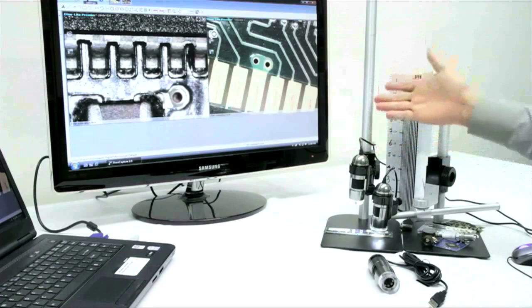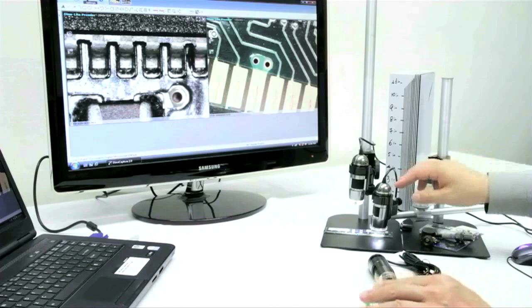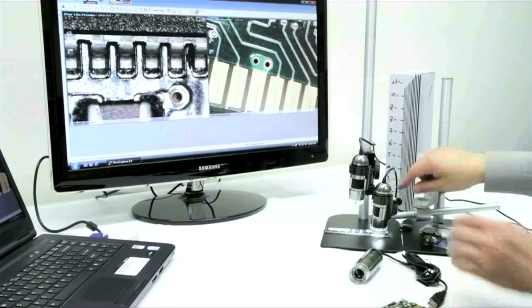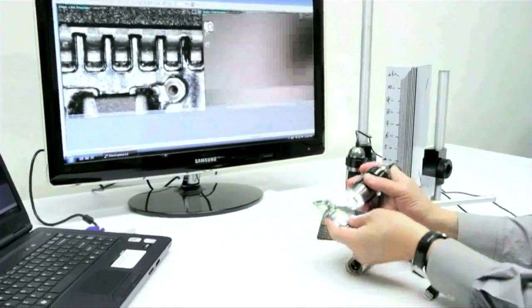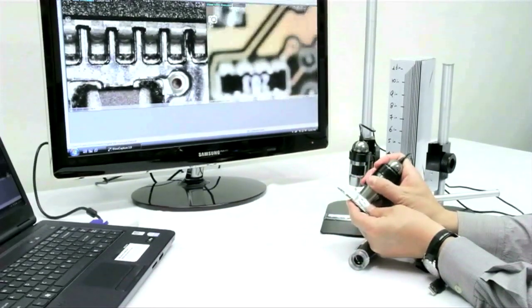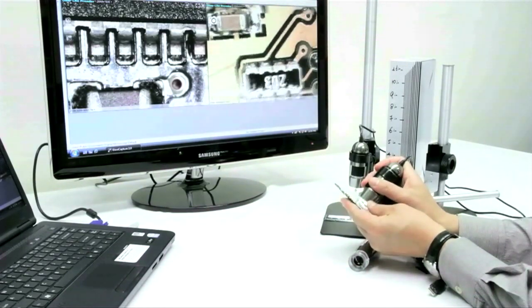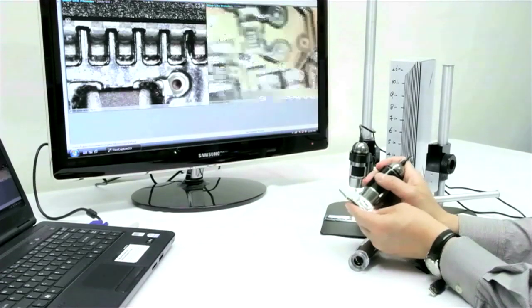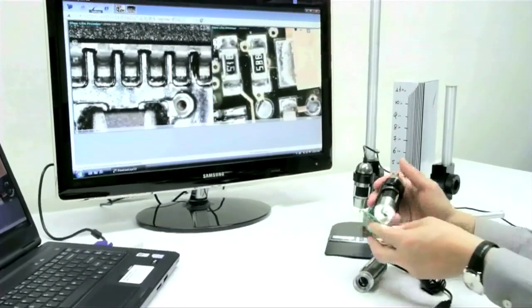When working with the L series, our longer working distance model, we do suggest working with a stand. Here we have shown the MS-35 and MS-36B. When working with a non-working distance model, you can either use it in a stand or utilize it handheld. When using this microscope handheld, you can work at a zero working distance, essentially touching the object, getting into focus 50 and 200 plus times magnification.